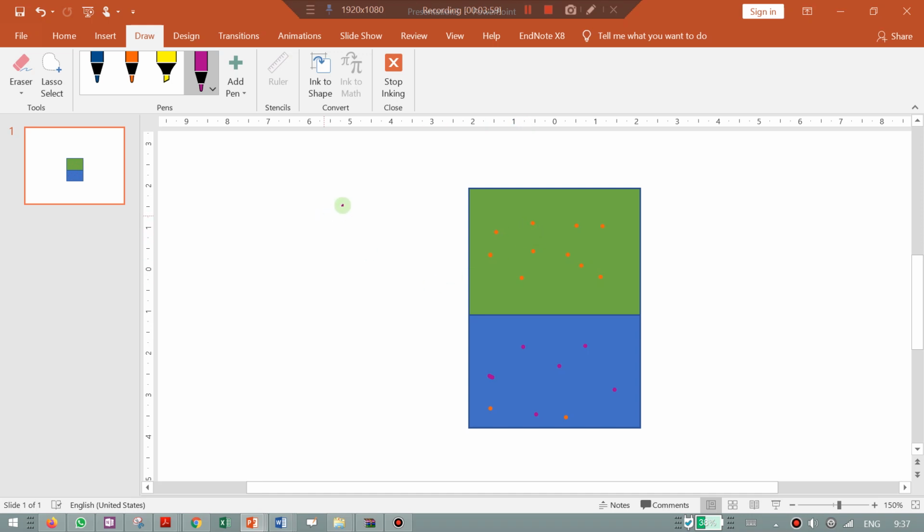Okay, and this is the basic idea of the liquid extraction. You might get 80% to 120%, so that your extraction is very good. As long as you get 80 to 120%, the extraction is good already. But if you get less than that, it means that your extraction is not that good.